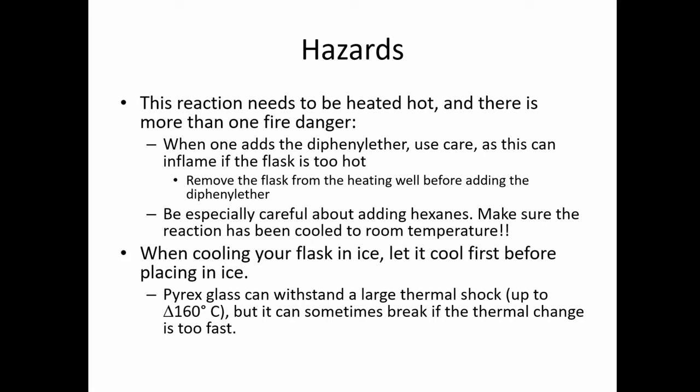So hazards: again, heat is the biggest one. You need to be aware of the fire danger when working with this experiment. As I said before, when we add the diphenyl ether, we need to be very careful because it can inflame if the flask is too hot. That's why we remove it, add the diphenyl ether, then put it back. And this is even more the case for the hexanes. We cannot add the hexanes if it's even remotely hot. We have to let it cool to room temperature.